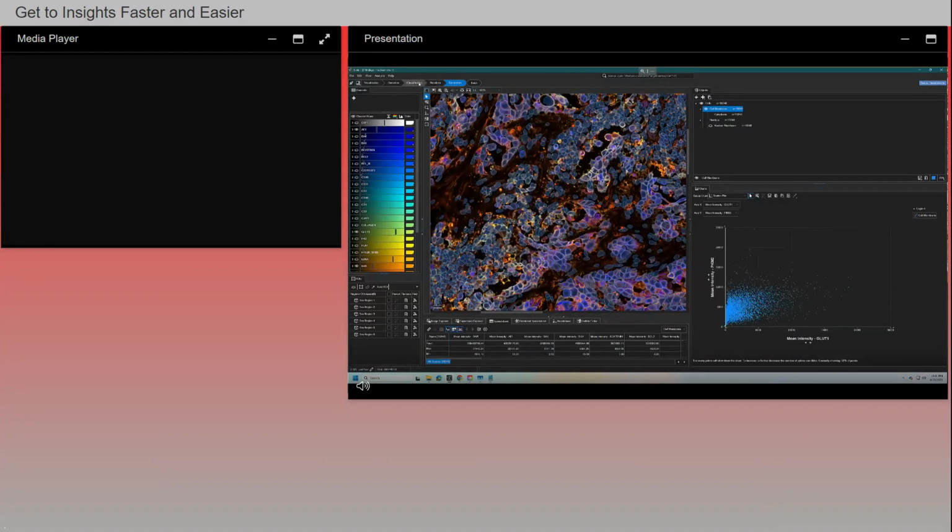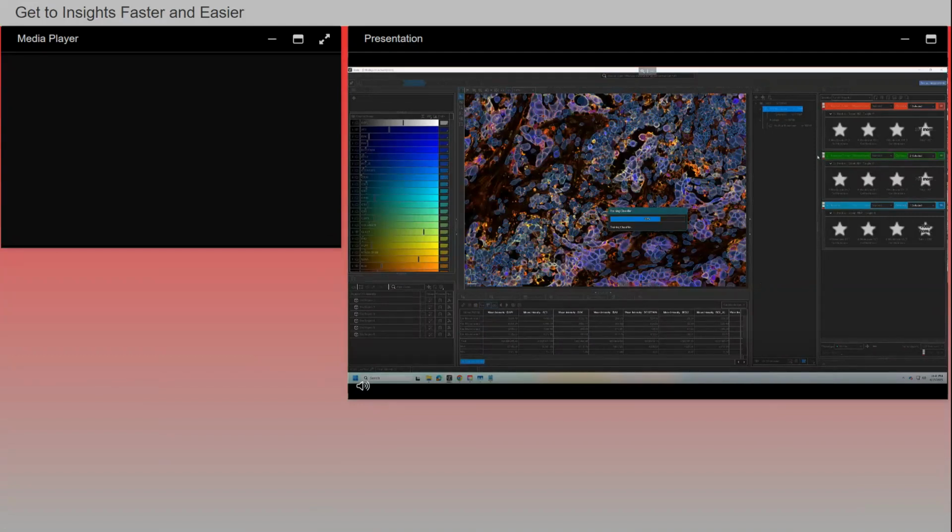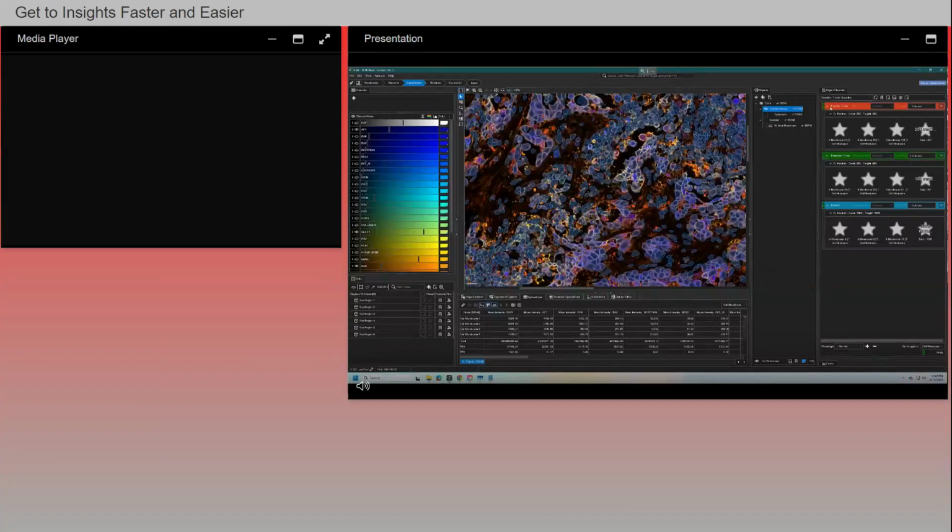Now when I get back to my classification, in that short step I've already trained over 7,000 cells that are normal. Normoxic is about 800 cells that I've included, and hypoxic is about 267. So what I'll do is I teach, and you'll see this confidence meter that Aivia has that tells you whether Aivia is confident it can classify. In this case, yes indeed. I'm on a remote desktop, therefore you don't see the cell outlines, but if you were working on your own desktop, you'd be seeing actual cell outlines here.